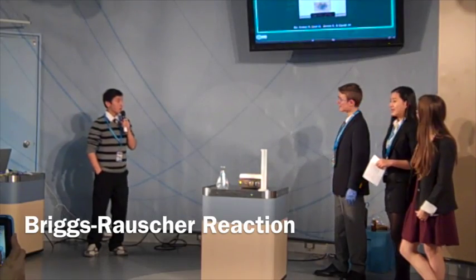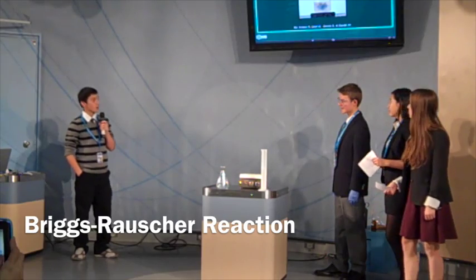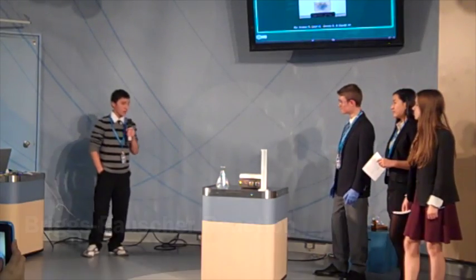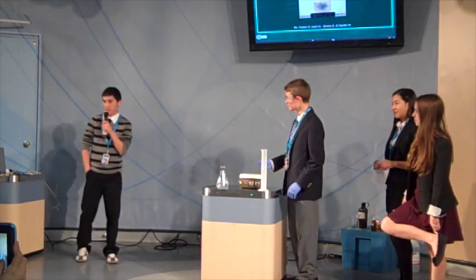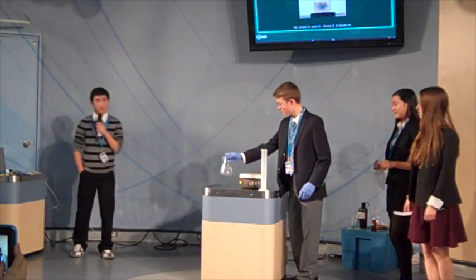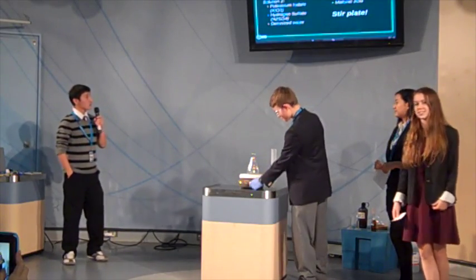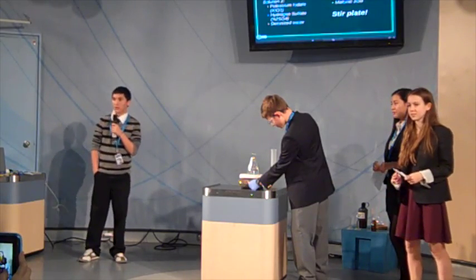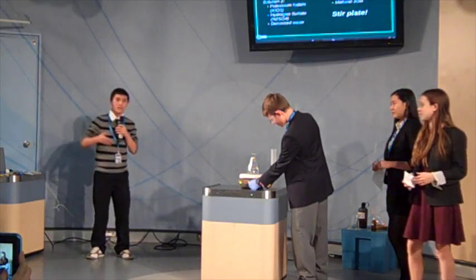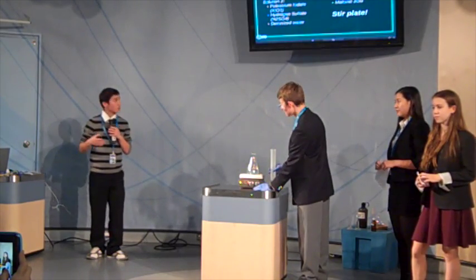Alright, so today what we're going to do is the Briggs-Rauscher reaction, which is also known as the oscillating clock reaction. So, Liao will now start the reaction and I'll explain it as he does that. There's a lot of components to this reaction, and it's not fully understood how it works currently because there's so many things that are dependent on one another, and it's really hard to follow how it works.